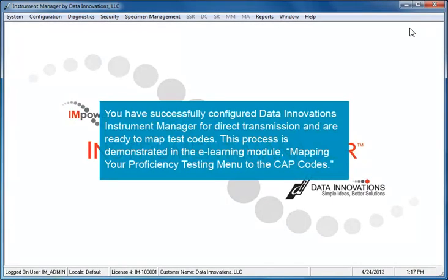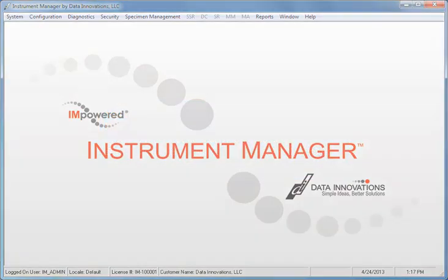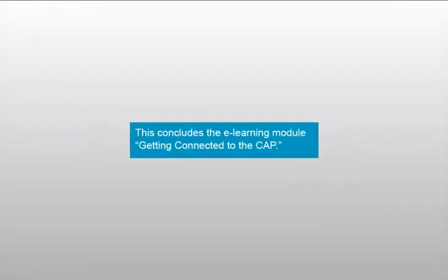That's it! You have successfully configured Data Innovations Instrument Manager for Direct Transmission, and are ready to map test codes. This process is demonstrated in the eLearning module, Mapping Your Proficiency Testing Menu to the CAP codes. This concludes the eLearning module, Getting Connected to the CAP.